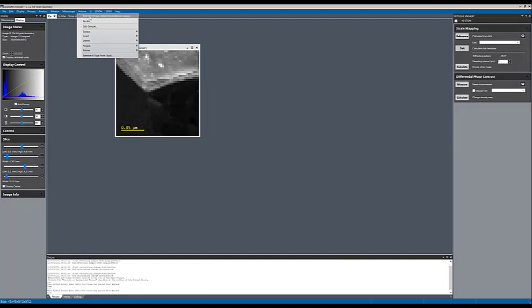And another thing is this option for reordering. When data is coming in from the camera, the way we store it is going to be the most efficient way to get the highest frame rate possible. So it could be first the spatial dimensions and then the diffraction dimensions, or the other way around.